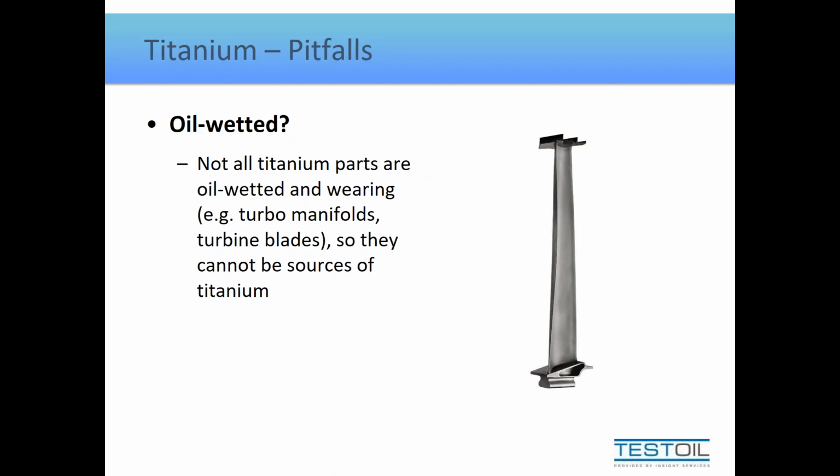So try not to fall prey to examples like this where different wear elements may be listed as sources, but then you have to ask yourself, how could that possibly get into my lubricant? If there isn't a logical path, then you can eliminate that as a potential source. And that's why I provided you with the paint example, because it's a far more logical source, even though it seems like it's way out in left field, it occurs actually very frequently. And there are people who are very, very confused when titanium suddenly appears because titanium is not commonly found. So they're always looking for that explanation.